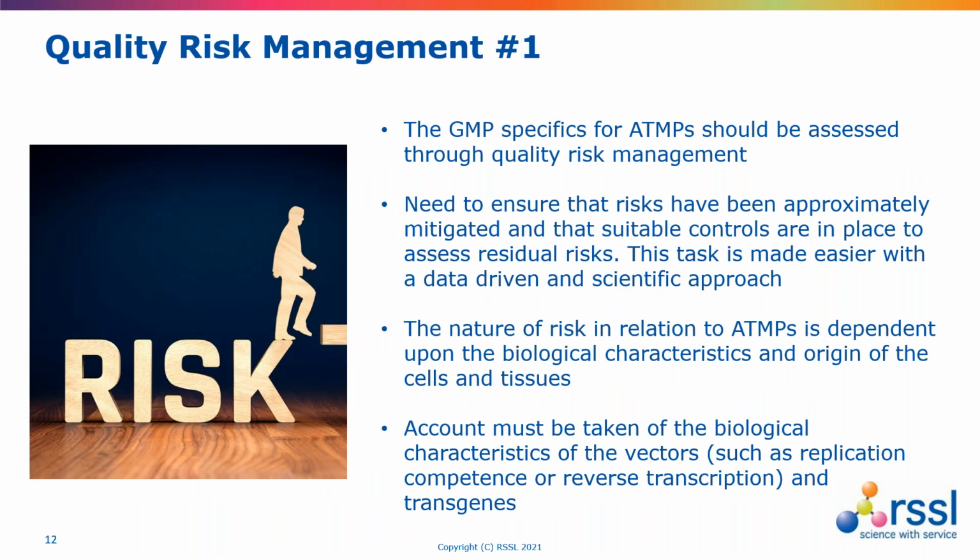There's also, as with all aspects of pharmaceuticals, but again, within these GMPs, specific reference made to quality risk management. So there's that requirement that a risk-based approach is adopted to enable the manufacturer of these products to design the necessary organizational, technical and structural measures that are required to meet GMP expectations.